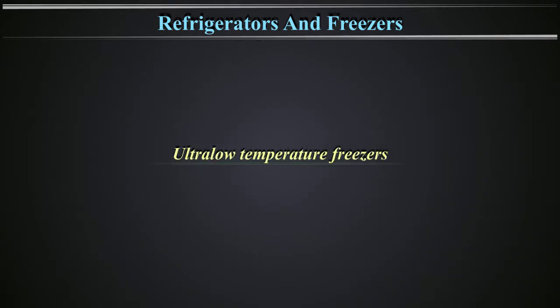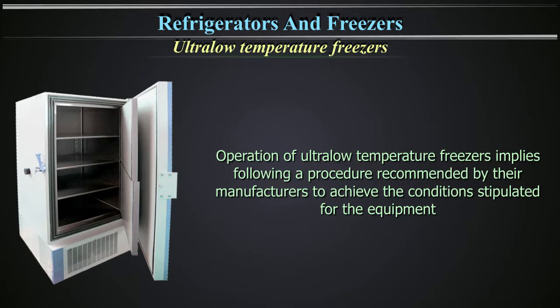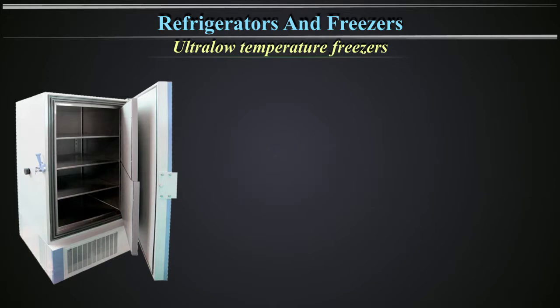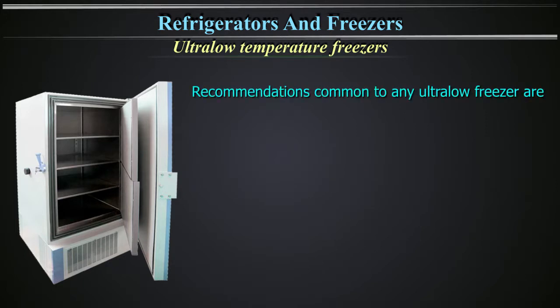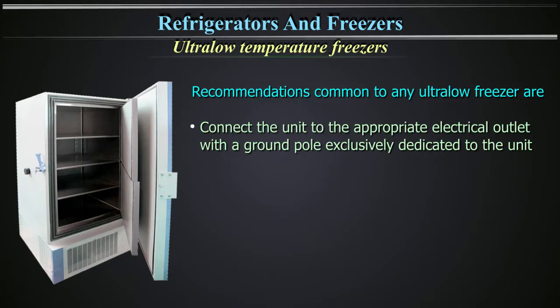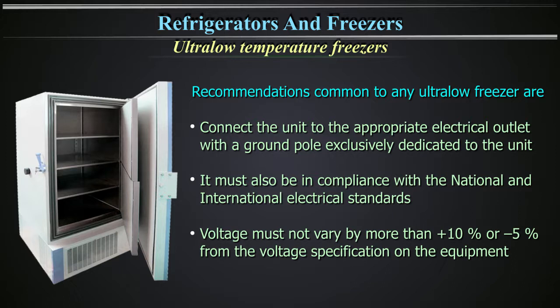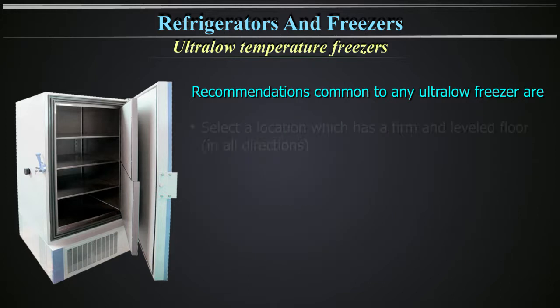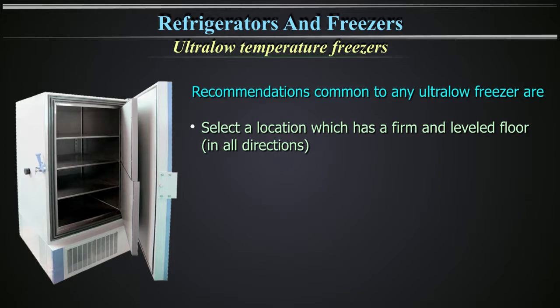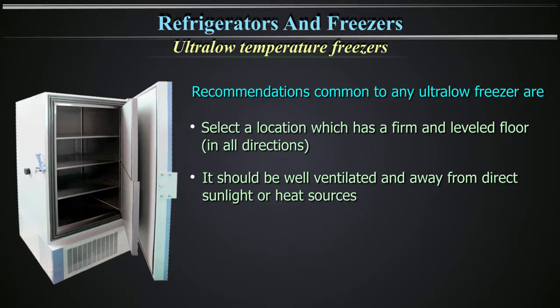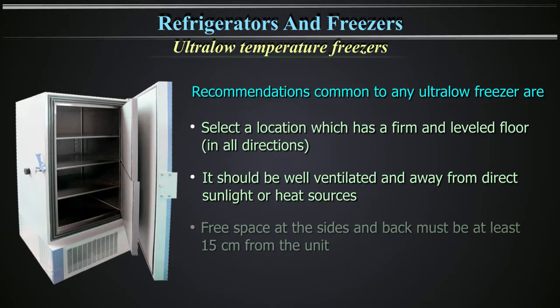Operation of ultra-low temperature freezers implies following a procedure recommended by their manufacturers. The recommendations common to any ultra-low freezer are: 1. Connect the unit to the appropriate electrical outlet with a ground pole exclusively dedicated to the unit, in compliance with national and international electrical standards. The voltage must not vary by more than plus 10% or minus 5% from the voltage specification on the equipment. Select a location which has a firm and leveled ground in all directions. It should be well ventilated and away from direct sunlight or heat sources. The free space at the sides and back must be at least 15 cm from the unit.